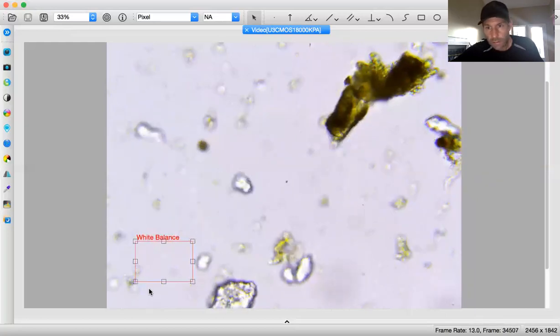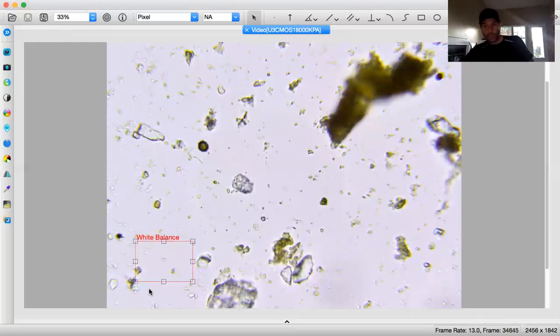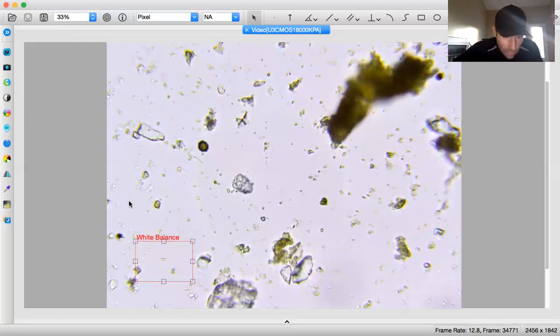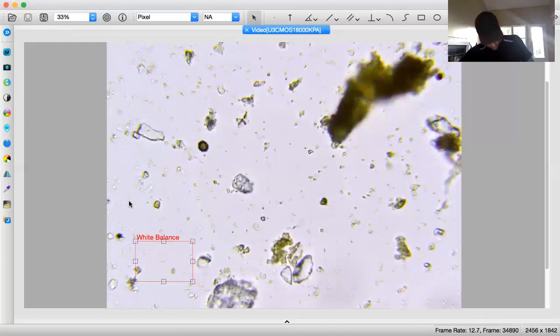Not seeing anything else recordable here, which is okay because we got some good stuff already. So I'm going to move on and we're going to go to number 5. Usually actino somewhere, and this could be, but again, it is not uniform. And at the end of it is all kinds of just not looking right to me. It looks like a fruiting structure of an ASCO. So I'm going to move on to number 5.